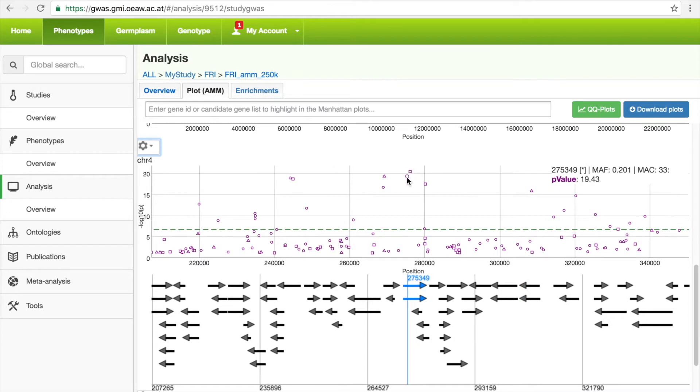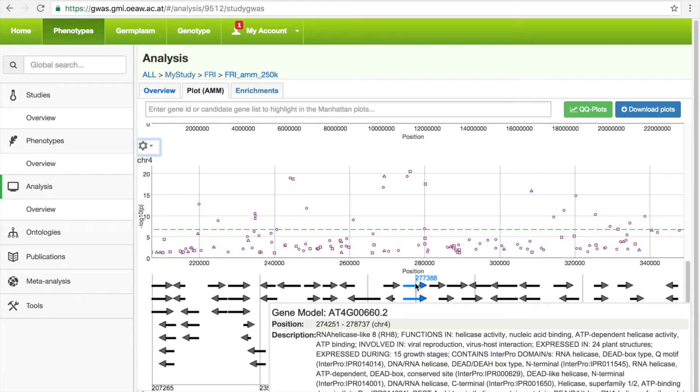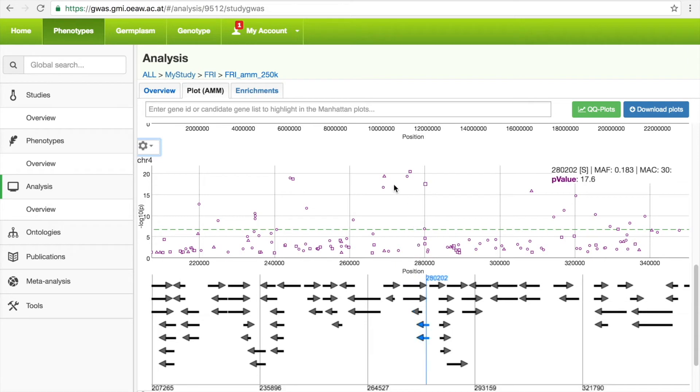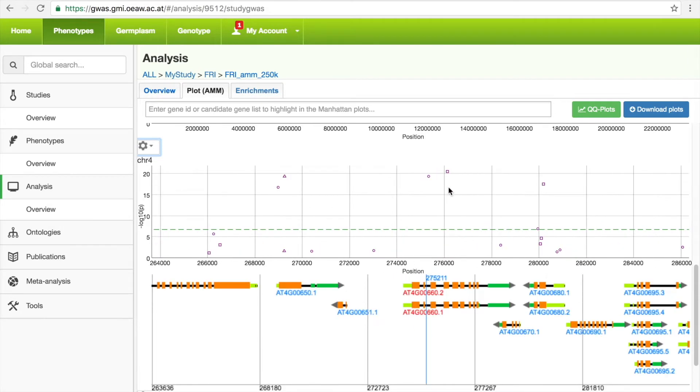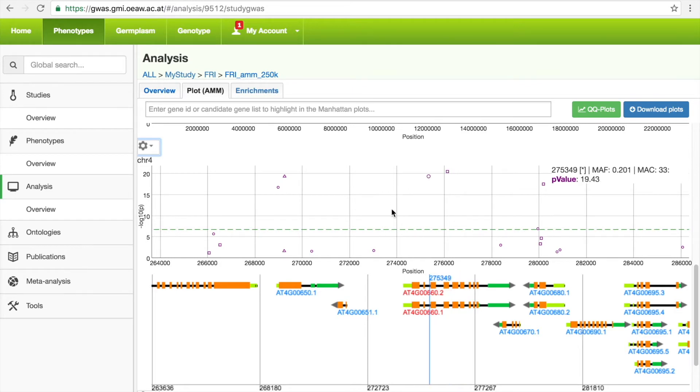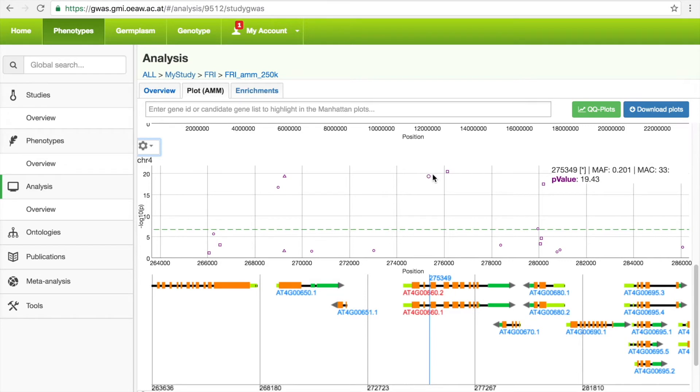If you mouse over a gene in the gene annotation track, the TAIR annotation data will be displayed. If you zoom in even further, individual gene features will be displayed. And, again, you can determine if a SNP is located in a coding or a non-coding region.